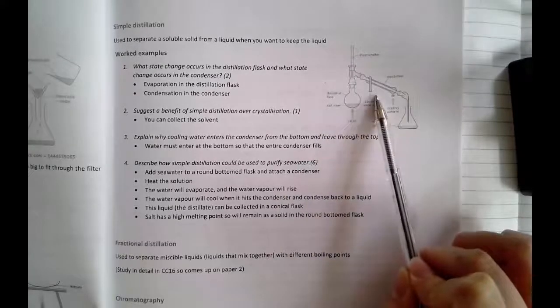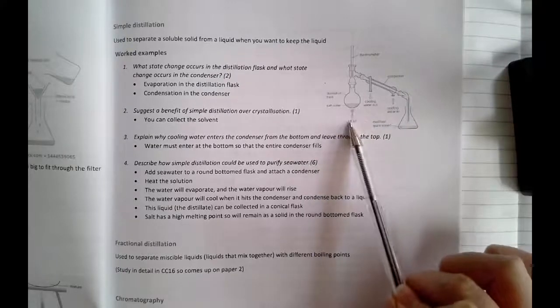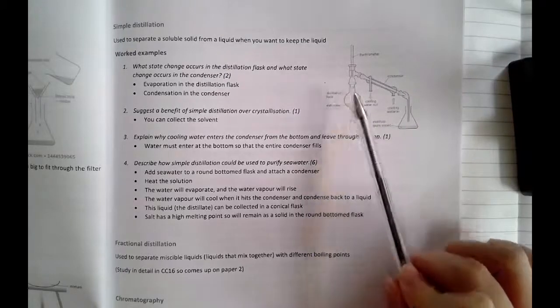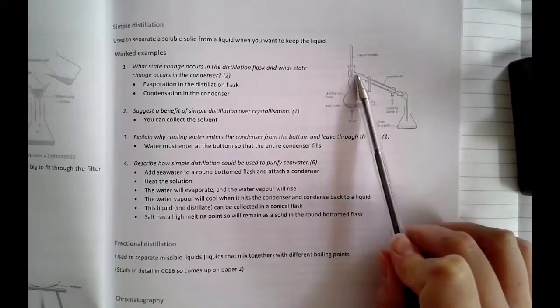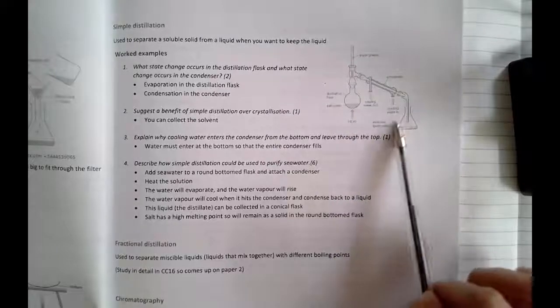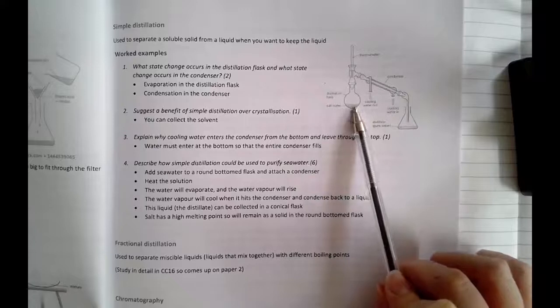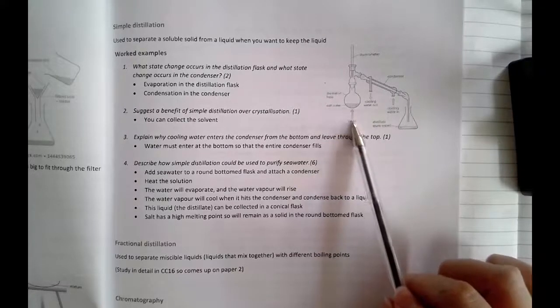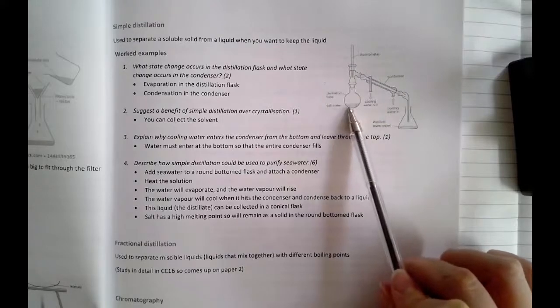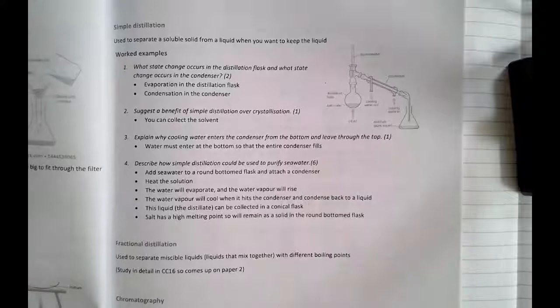You attach your condenser, you heat. Don't just say evaporate, okay? Mention how. You're going to heat, that's going to cause the water to evaporate, the hot vapor will rise, it will hit the cold condenser, it will cool and condense, and you can collect it as a liquid in a conical flask. What happens to the salt? Well, it's got a really high melting point, so it's not even going to melt with the heat that you are applying. It's just going to stay as a solid in your round bottom flask, and that allows you to separate the salt and the water.